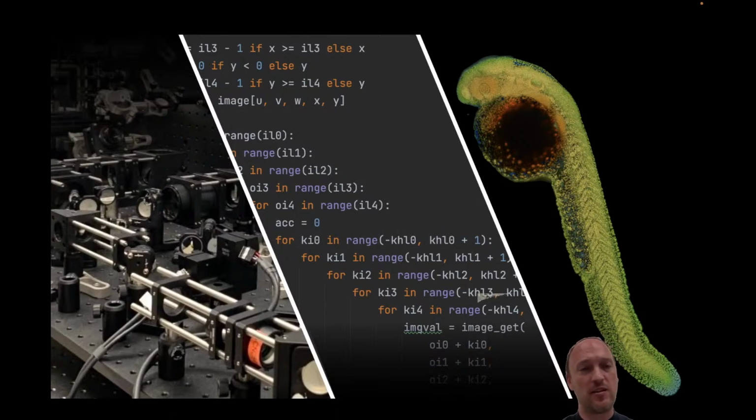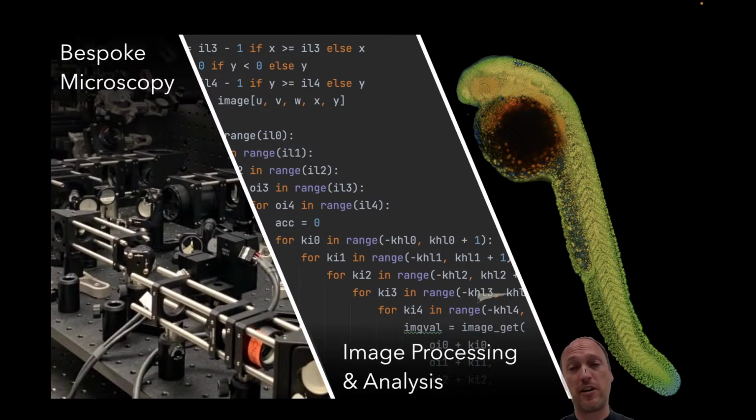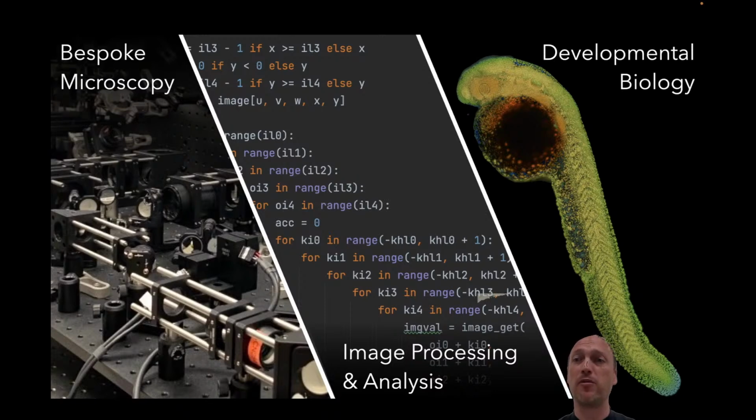We design and build light sheet microscopes. We also write a lot of code for image processing and analysis. And we use all these technologies to try to answer key questions in developmental biology.